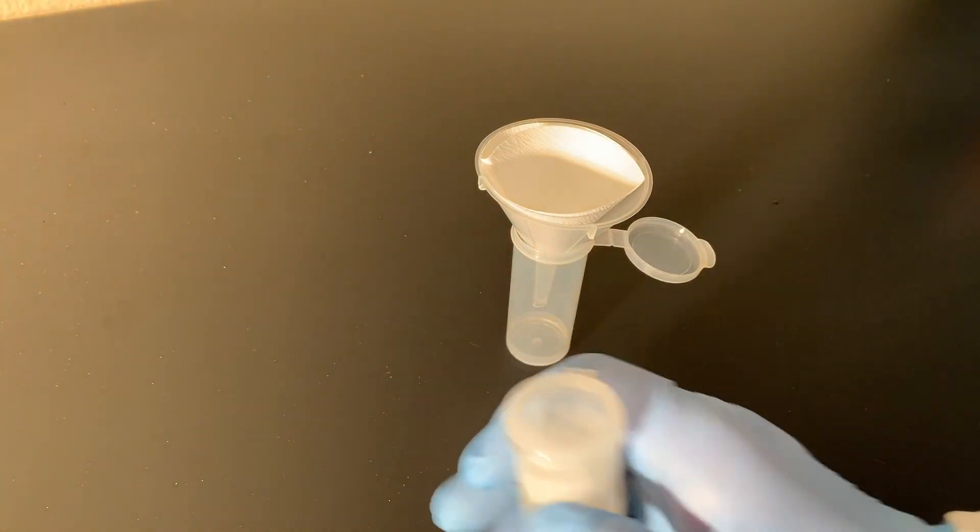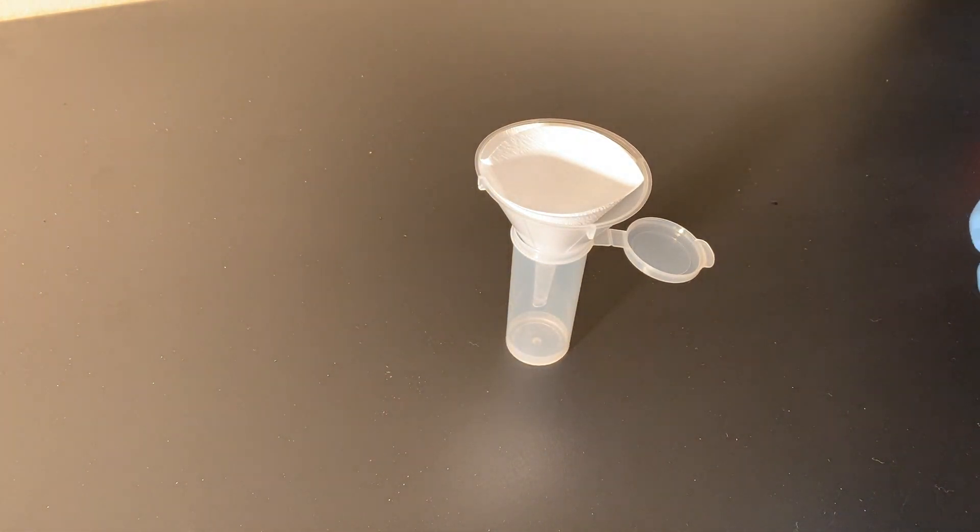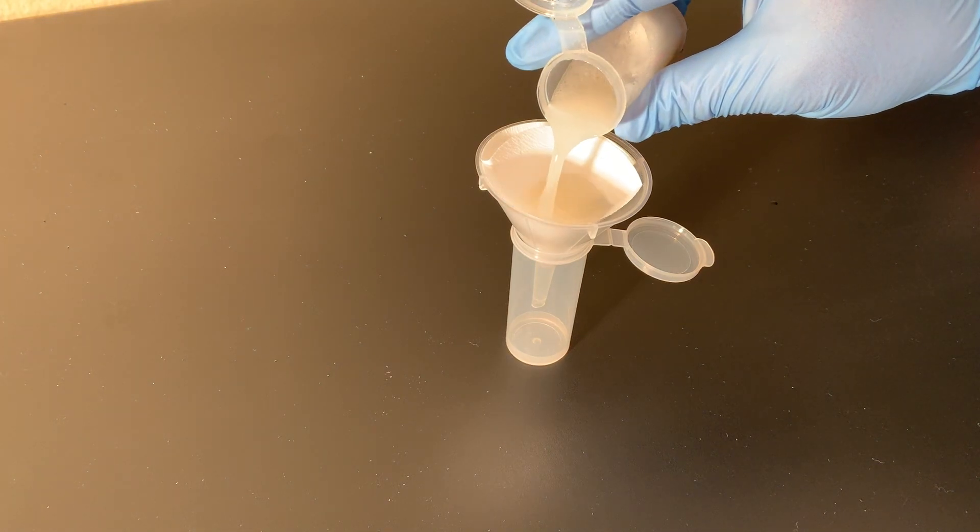Filter the extract into a clean tube. You can filter the extract for up to 5 minutes.